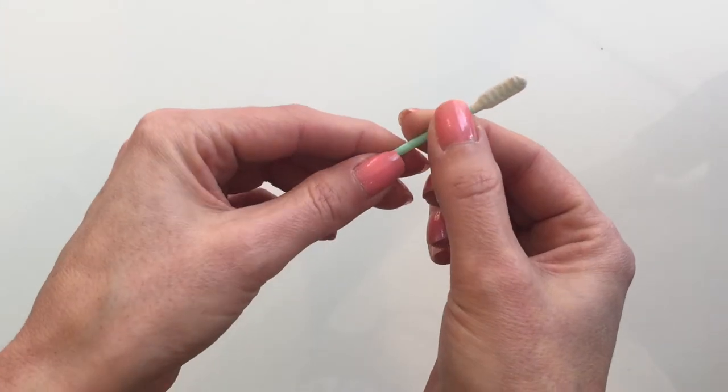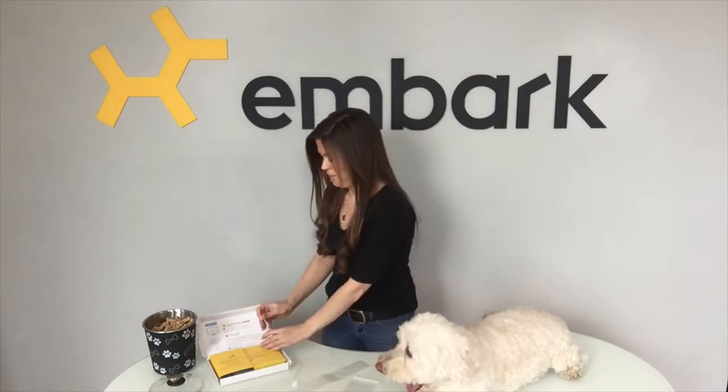Once you're done, look for the indented part of the swab shaft and snap it in two. Then insert the top part of the swab into the liquid buffer, screw the cap shut, and shake about 10 times to ensure that the swab head has made contact with the liquid.